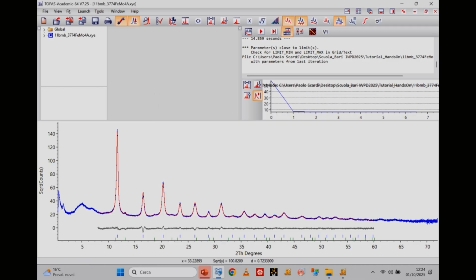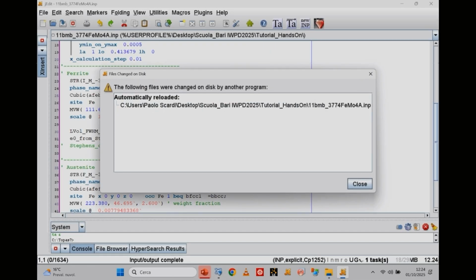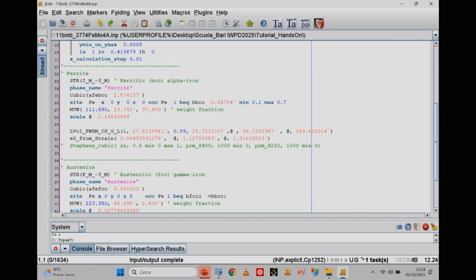So you see there are problems here with the peaks. You see that the residual is not at all good because of this anisotropy we talked about before. So let's see the result here. And what we get, you see 27, is more or less the same numbers you've seen in the slide. So it should be in the order of 9 nanometers, but it is not. So what can we do to improve things?